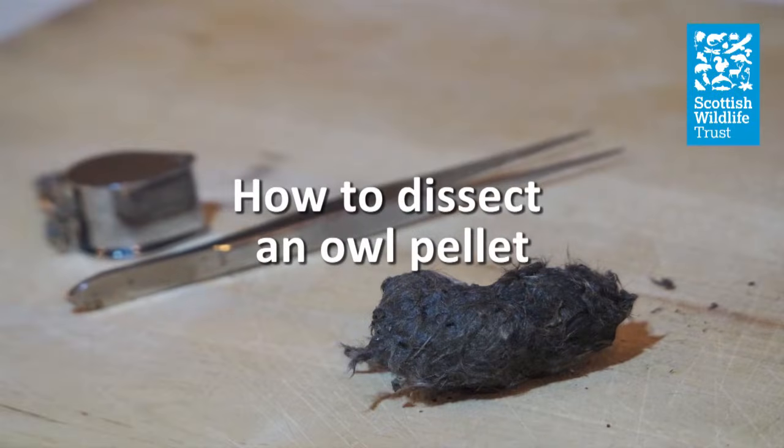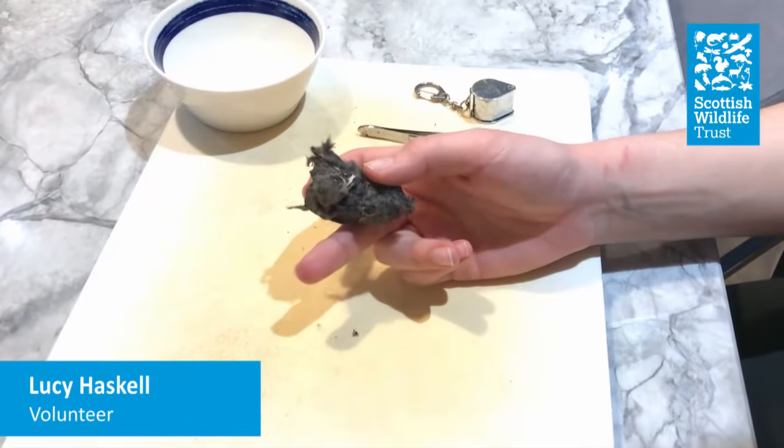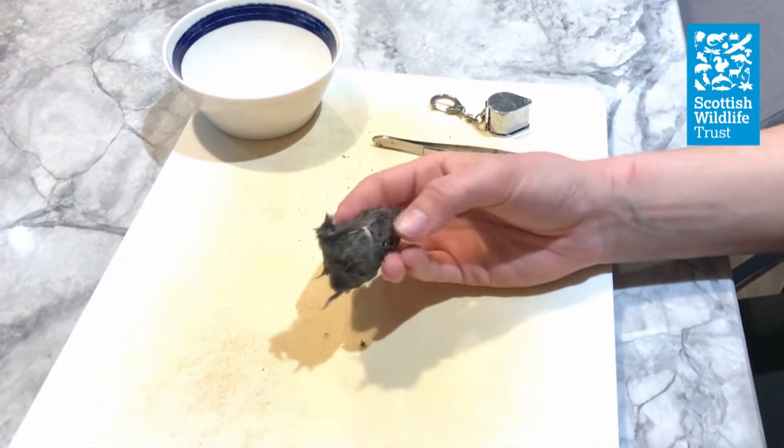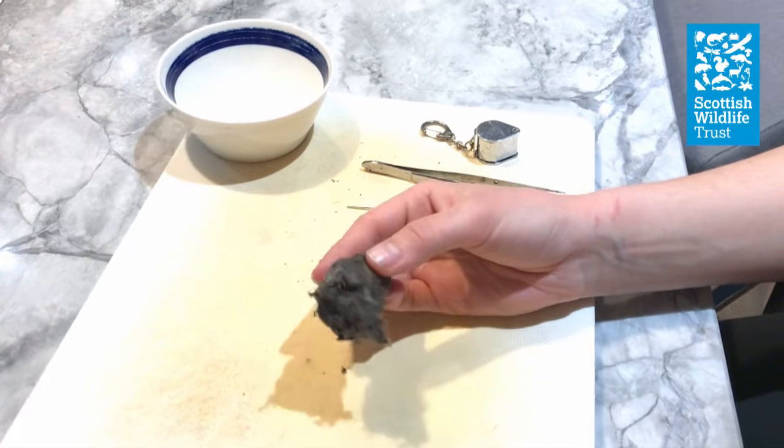Hello, in this video I'm going to be showing you how to dissect an owl pellet. Pellets can be bought online or you may find them under spots where owls often roost, for example under large trees or in old barns.